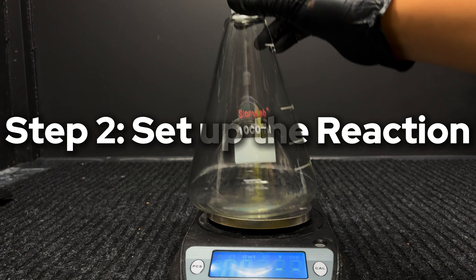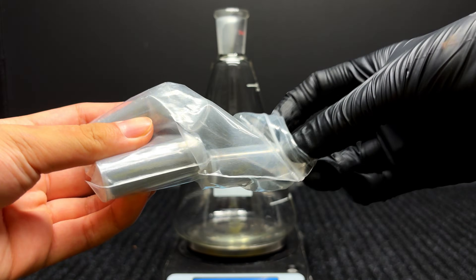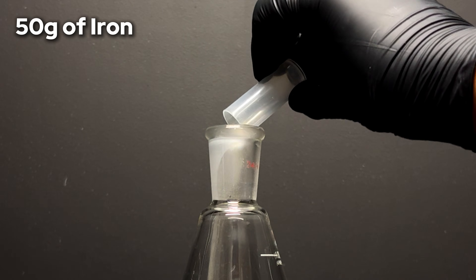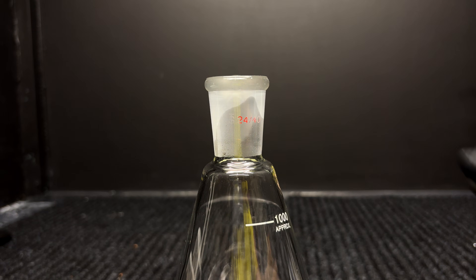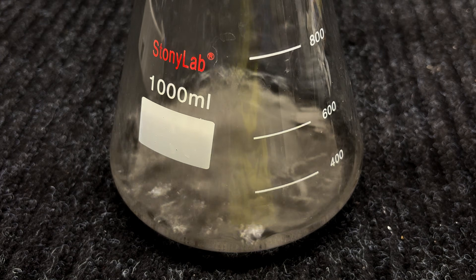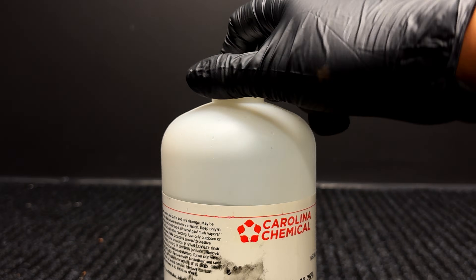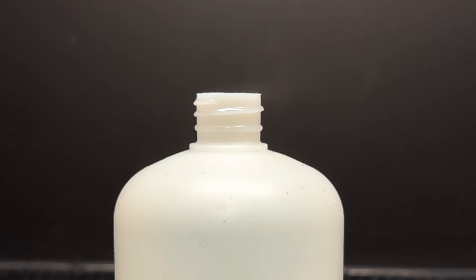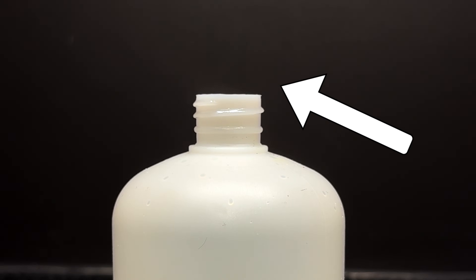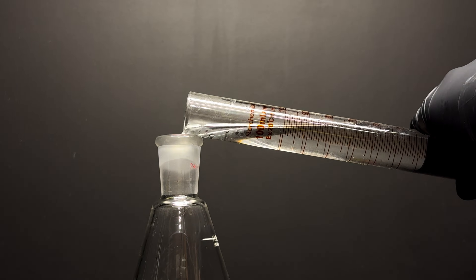Step 2: set up the reaction. After calculating the stoichiometric amounts needed for each chemical, I can set up the reaction. Onto a scale with a 1-liter Erlenmeyer flask, I measured out around 50 grams of iron powder — it actually surprised me how much 50 grams was. I then poured around 200 mL of water into the Erlenmeyer flask so the acid wouldn't be too concentrated. Finally, I cracked open a bottle of 37% hydrochloric acid, a 12-molar solution, and poured 150 mL of the acid into the flask in a fume hood to not breathe in the vapors.